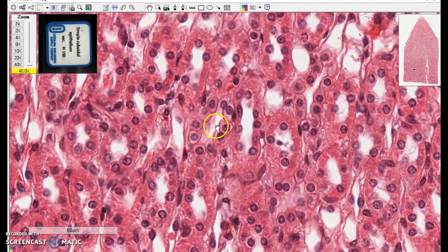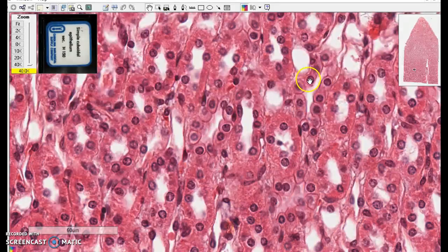So again here's the inside of the tubule and these are individual cells that are making up a simple cuboidal epithelium. They have slightly different look because they're forming slightly different types of tubes. But here's the nucleus. Here's the moderate cytoplasm around it.